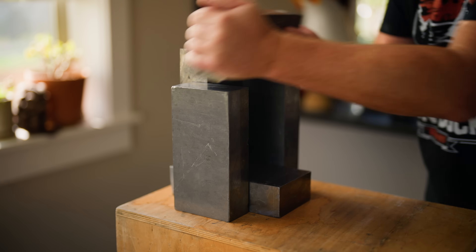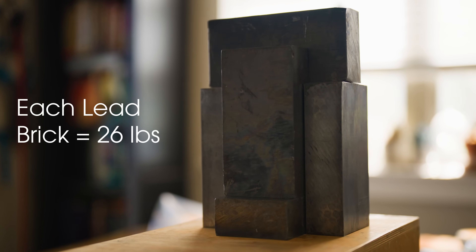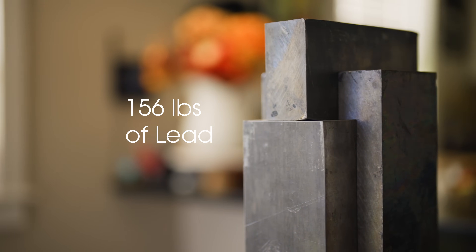This is a lead castle, and it's made up of six lead bricks. Each brick weighs about 26 pounds, and so this total configuration weighs about 156 pounds. I'm going to paint these bricks white after this video, just because handling bare lead is not the greatest — it does rub off on your fingers, and it's not the best thing if you ingest it or if it gets into your bloodstream. This setup blocks most exterior radiation sources.